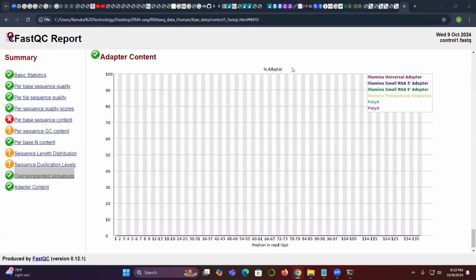Yeah. And ma'am, tomorrow which topic will you teach us? The trimming part. We'll discuss not in detail the trimming part. I will discuss only the command for Cutadapt, because in future you might get the adapter sequence, right? So we'll discuss how to see the commands for Cutadapt, and we'll perform the mapping part further. Okay. Thank you. And make sure you guys are having HISAT2 tomorrow.